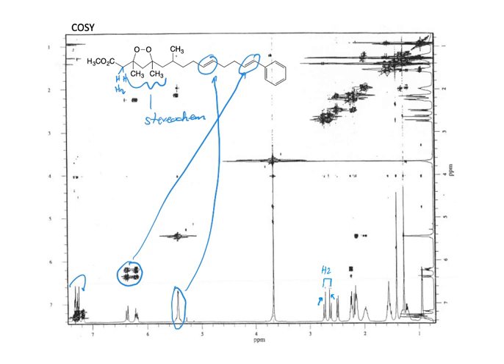And there's another set that's going to be important for what we're going to look at here, between this doublet here and I think a doublet right in here, which is a little bit harder to see, and those are the H4 protons. So those are on this CH2 group in the middle in this ring between these 2.